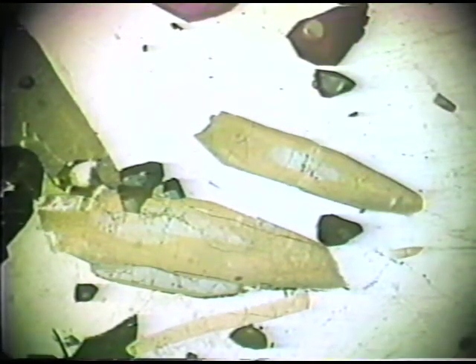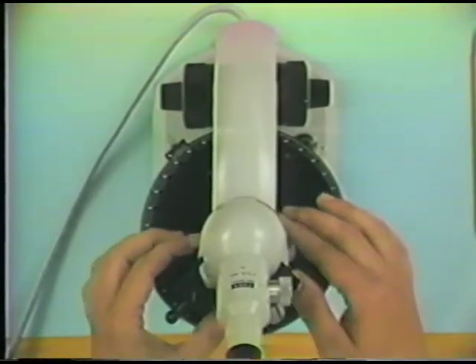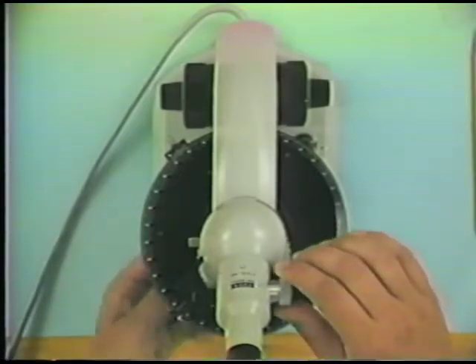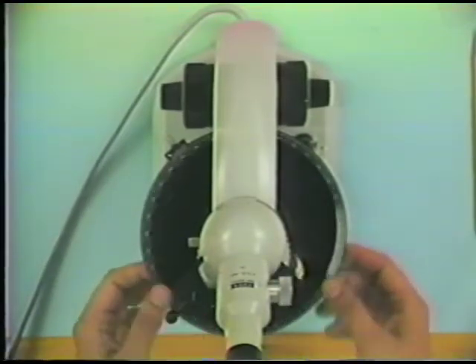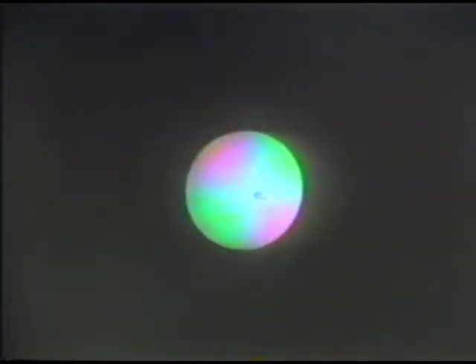Well, if we take the same mineral grain now, while we're looking at it, and change to our high power, increase the light, look at the mineral in conoscopic view, and obtain an interference figure. And here we can see that the interference figure on this particular grain is a flash. And upon rotation, you can see again the isogyres first leaving in the northwest direction, now in the northeast direction, northwest, northeast. This tells us again the direction of the E ray.